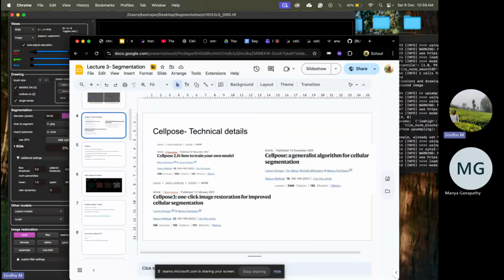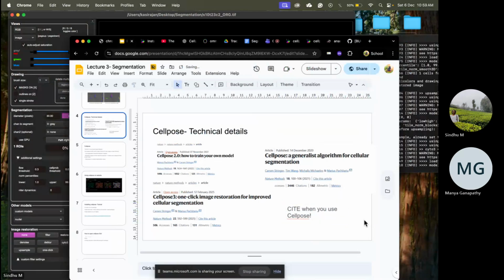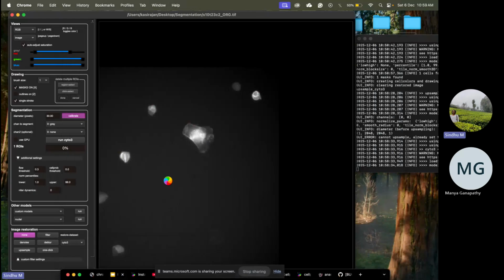So these are what you have to cite. Okay, it's still estimating the parameters.